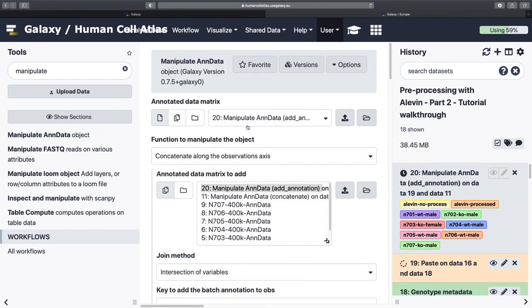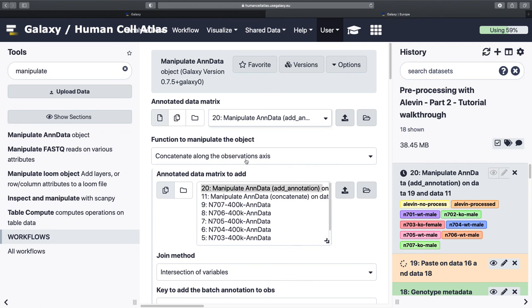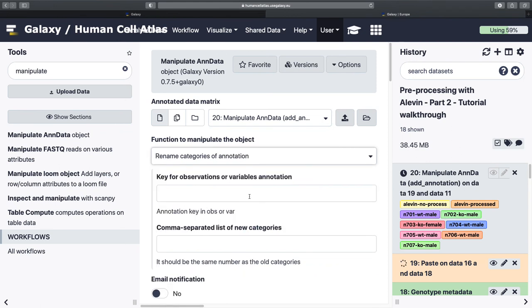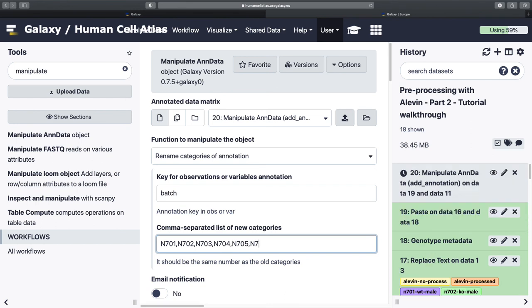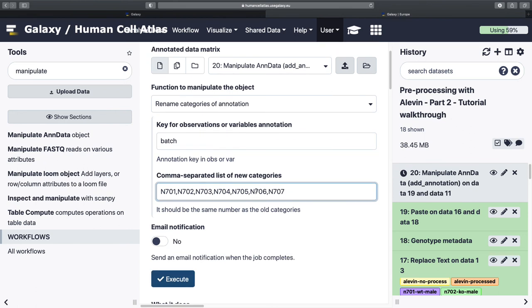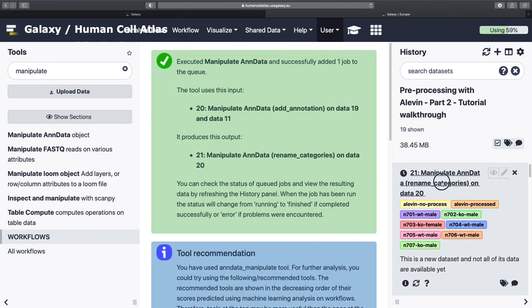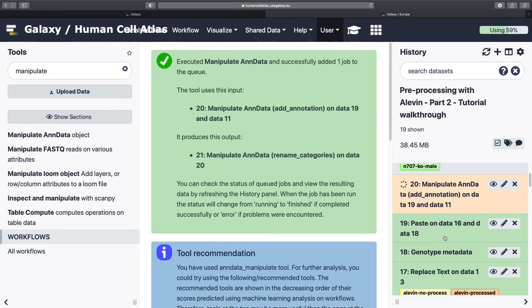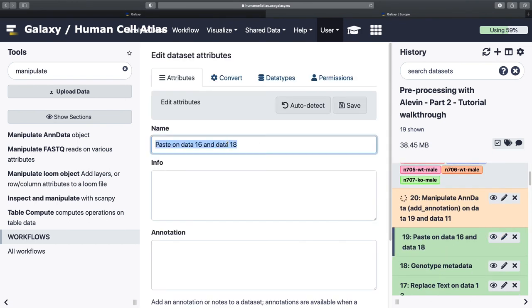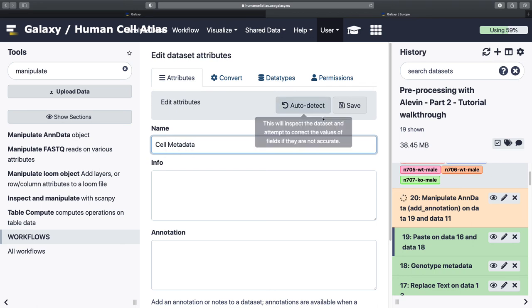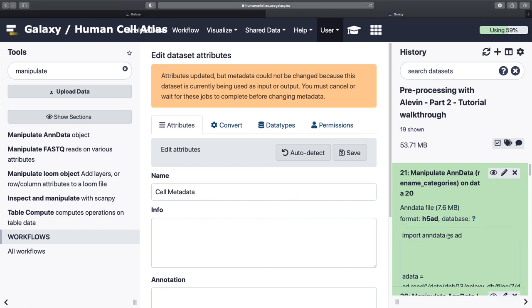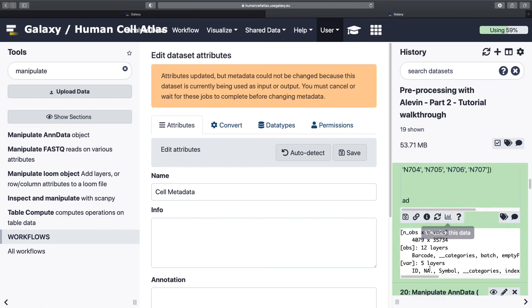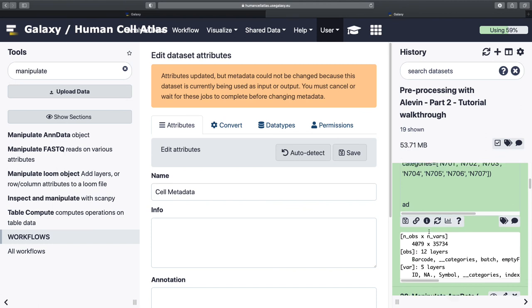So add new observations and it's going to be that. And while that's working, we also know that there's some labeling is poor. So we're going to try and rename these categories of annotation. So rather than where we have it being batch 0, 1, 2, 3, 4, 5, 6, we're going to rename them their actual indices from the experiment. And this, I've seen people fail here because if you get to this step and it doesn't work, it's often because you didn't actually concatenate all of the data sets in that very first concatenate step. So if this one fails for you, check that and make sure you didn't accidentally add like one data set twice or missed off a data set. And we're so close. Got all of our lovely C. Now we have genotype and sex are in our observations or cells information.